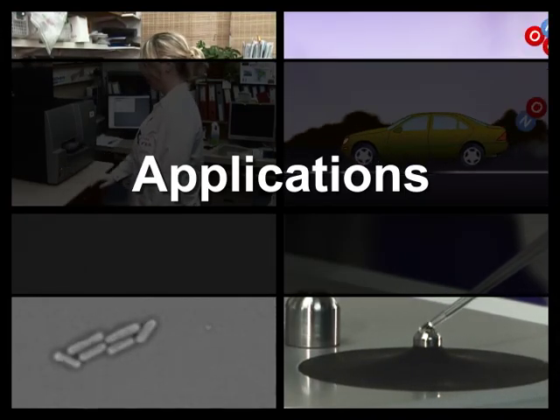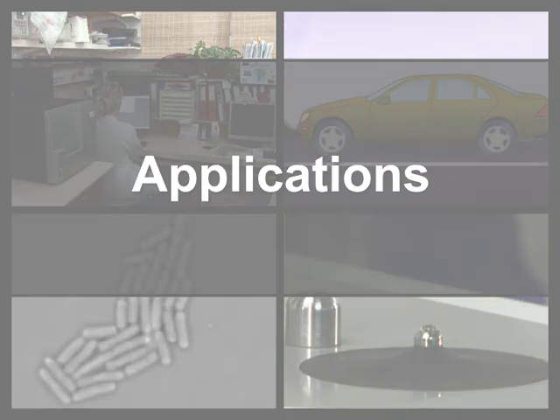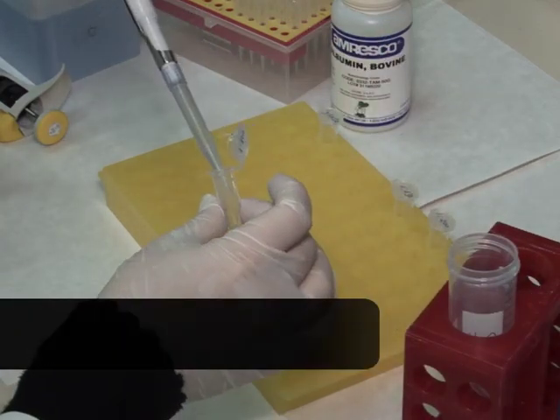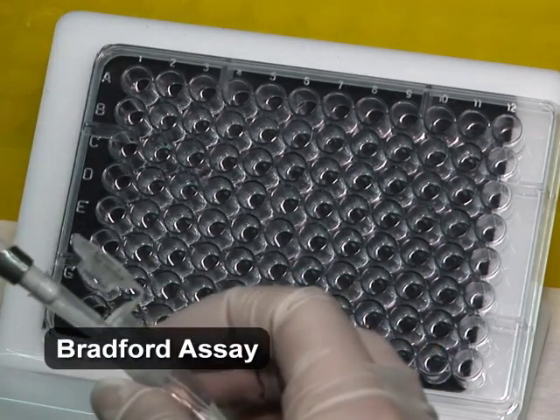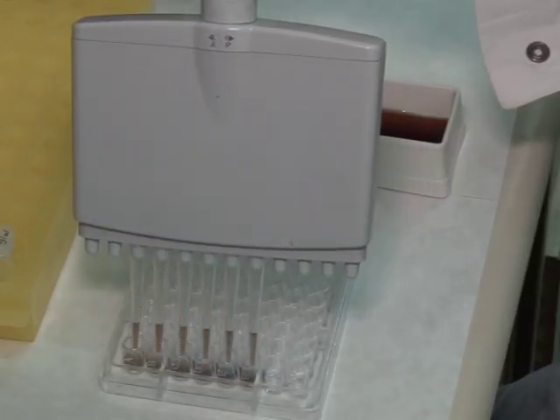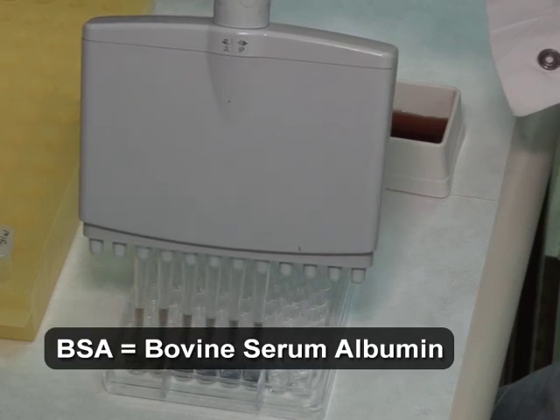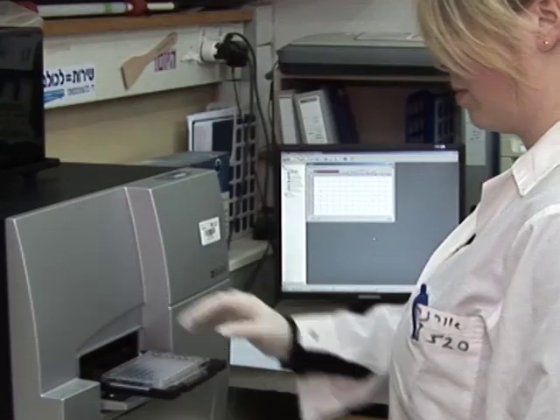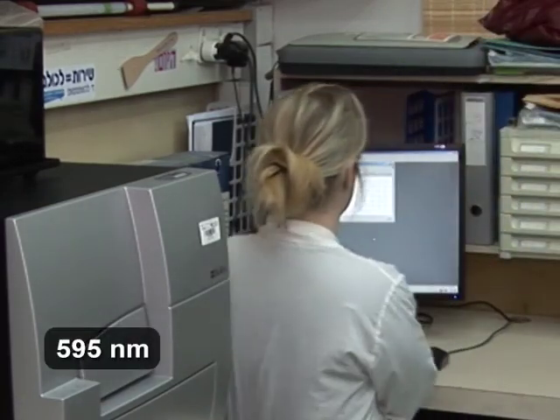UV-Vis spectroscopy is used heavily in many different research areas to identify or quantify a sample. For example, UV-Vis spectroscopy is used heavily in biological fields to quantify the amount of protein in a sample. A Bradford assay is often used to quantify proteins with the aid of a dye. First, a calibration curve of known protein concentrations is prepared, typically using bovine serum albumin, or BSA. Then, Coomassie blue stain is added to each of the standards and to the sample. The absorbance of the protein-dye complex is then measured at 595 nanometers.